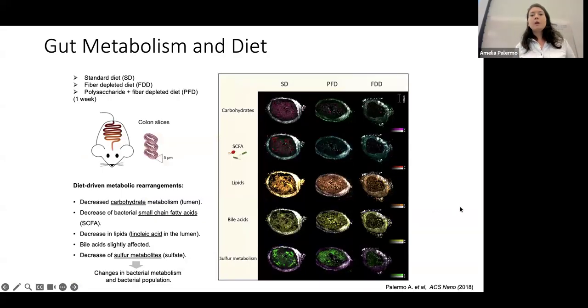So this was really the unique aspect that enabled us to have a more comprehensive overview. And then when we looked into comparative studies, meaning are we able through this approach to actually capture changes at the metabolic level with spatial resolution, and at the same time having a semi-quantitative measurement of those changes. And the answer was yes.